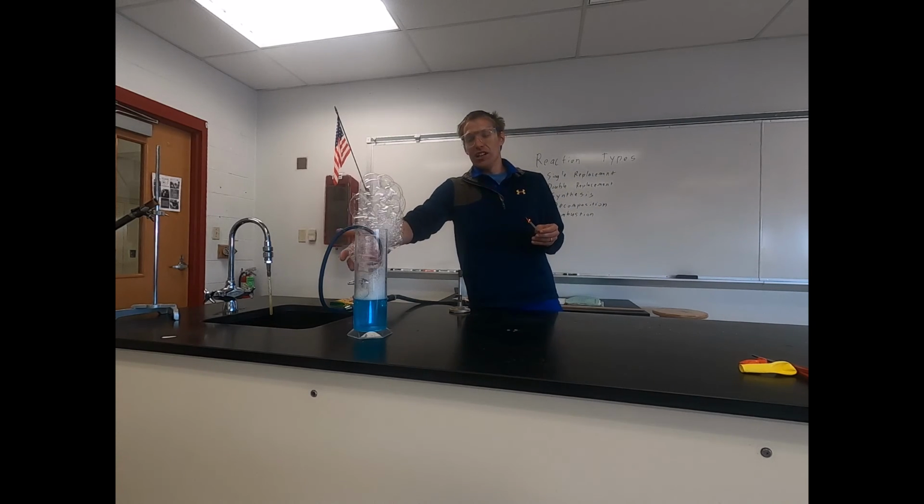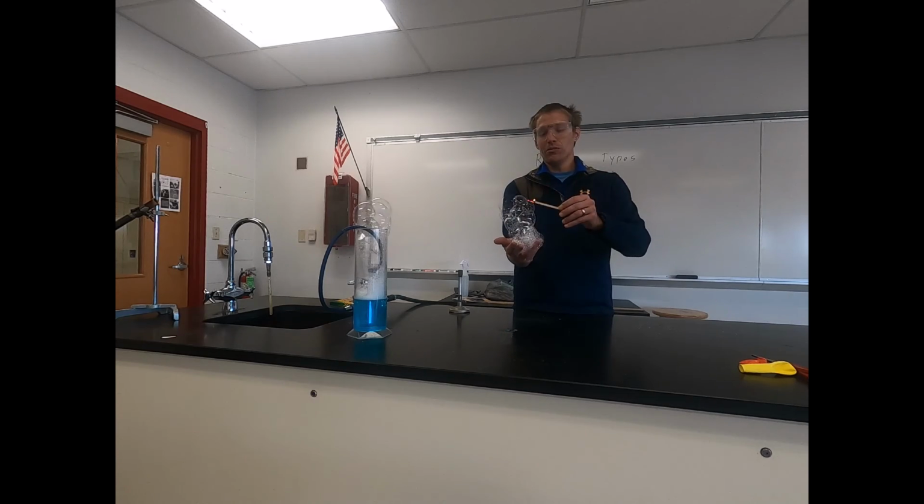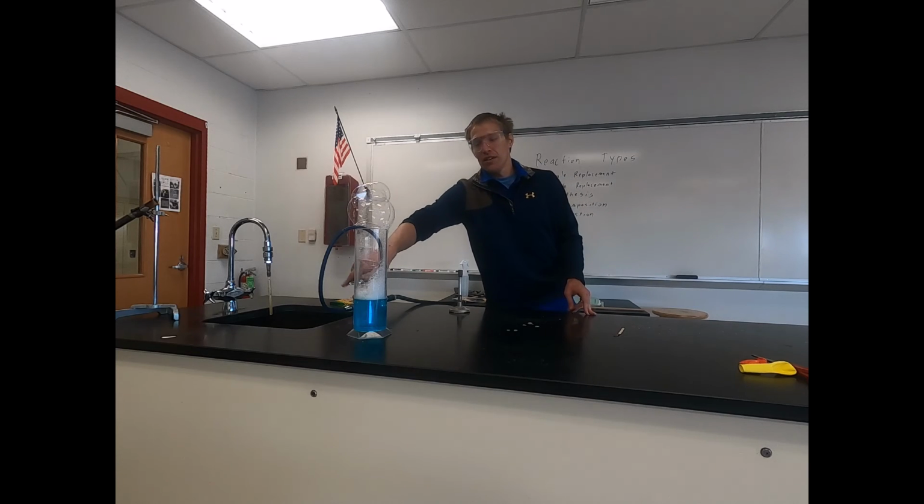So this again is another example of combustion. So we take a wooden splint, we take the bubbles, and we just light it on fire. So that's a combustion reaction.